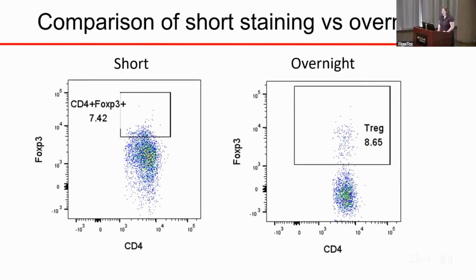And we also have, as Paul was mentioning, a very tricky transcription factor, FOXP3. We're very interested in Treg cells in our lab. So I'm showing you here cells that are positive for CD4, and then we're looking at the transcription factor FOXP3. And again, I think this one is the most striking. It's very easy to see which ones are FOXP3 positive, or Tregs, as opposed to the negative, in comparison to a short stain instead.